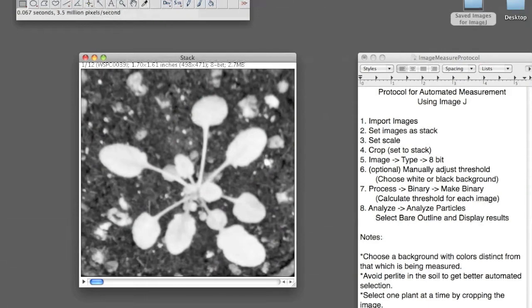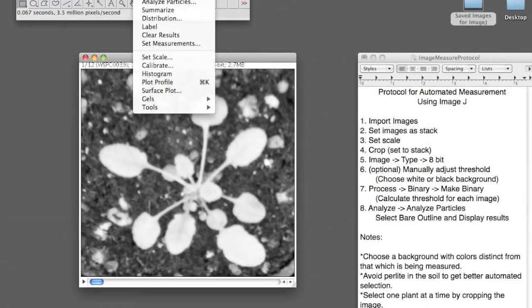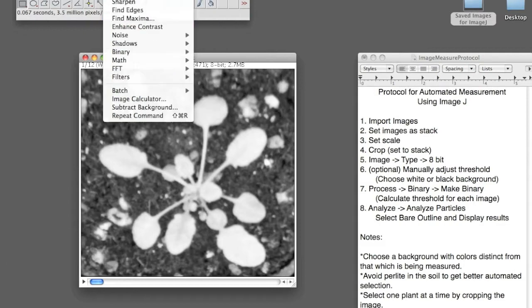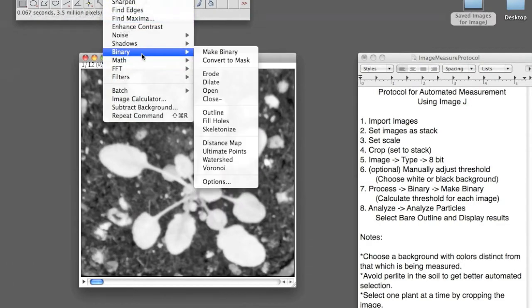And next, you want to convert the image into a binary image. You can do this by going to Process, Binary, Make Binary.